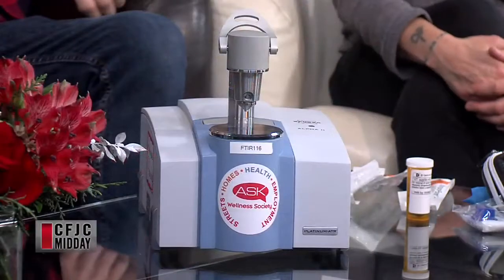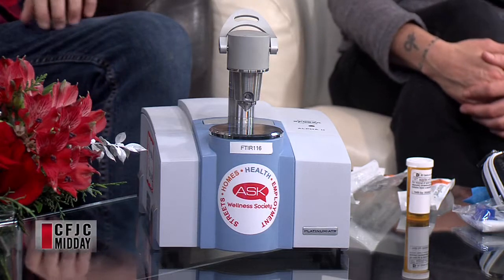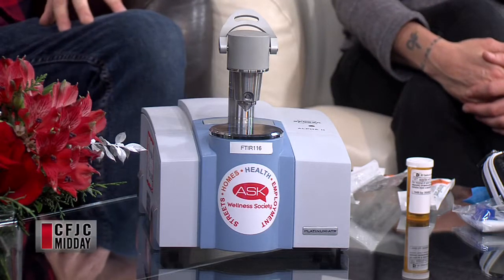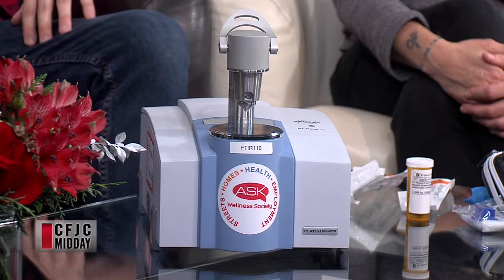So the issue with fentanyl is that it needs to be present in a high enough quantity. There are other instruments that have the advantage of being able to separate out all the components and look at each one individually. This one, the advantage is it's really, really quick. It doesn't separate everything out. It takes a snapshot of the substance without separating out the components. So to run the test, it only takes about a minute, but it will only detect things at around 3 to 5%. And fentanyl can still be harmful far below that.